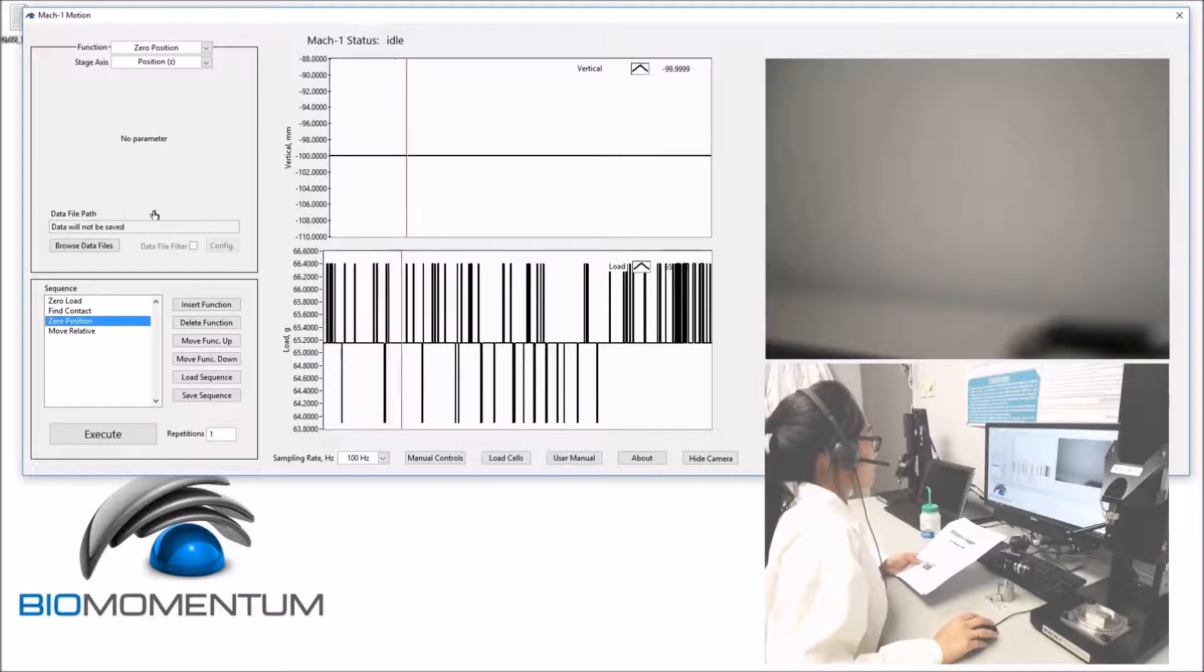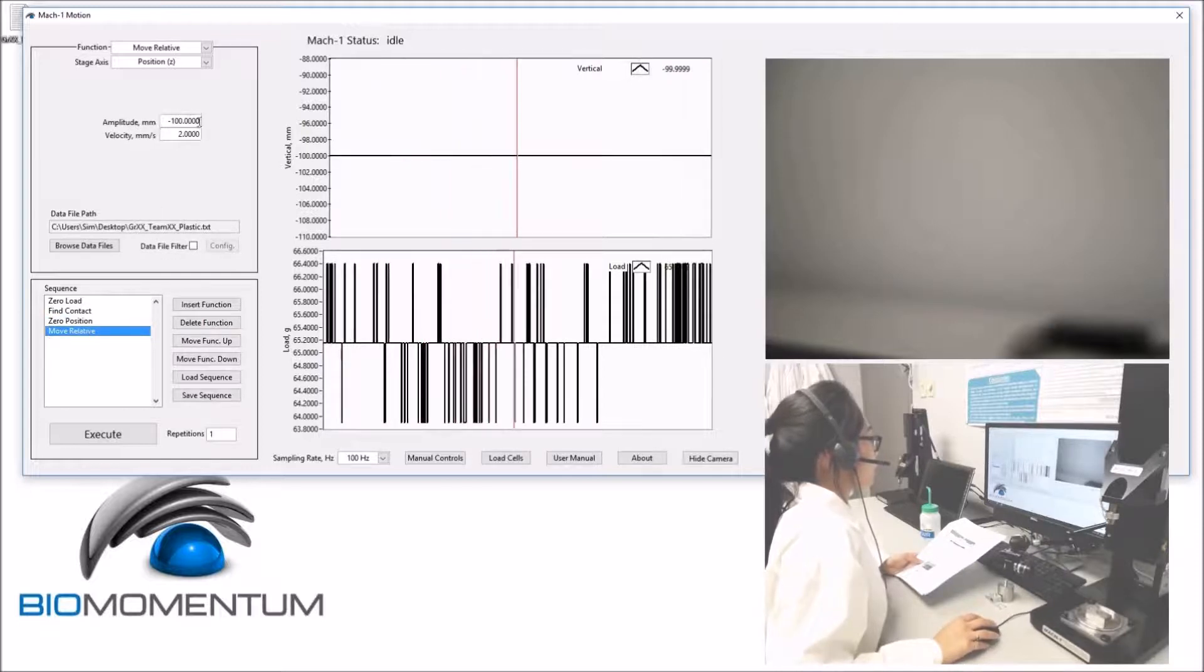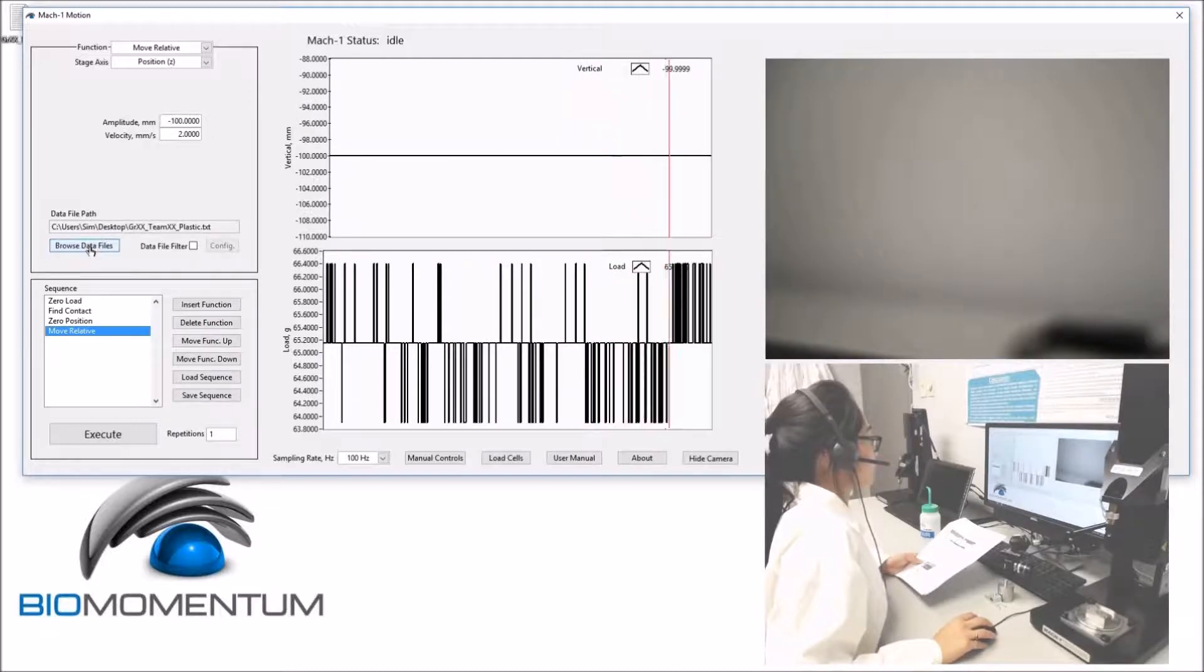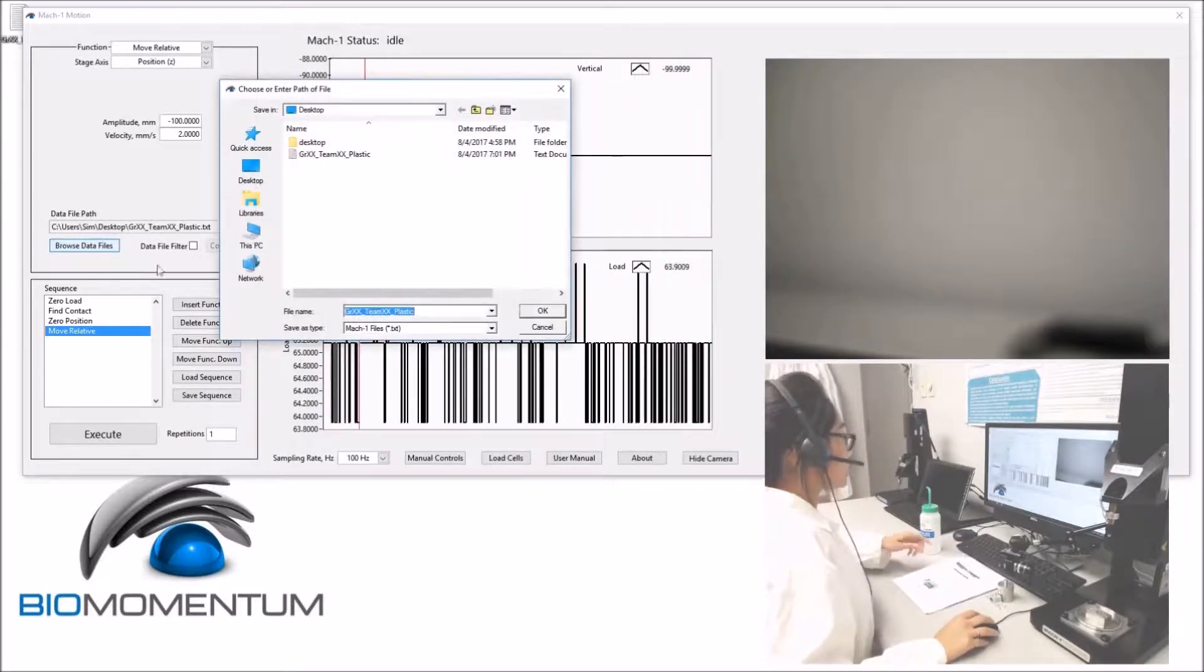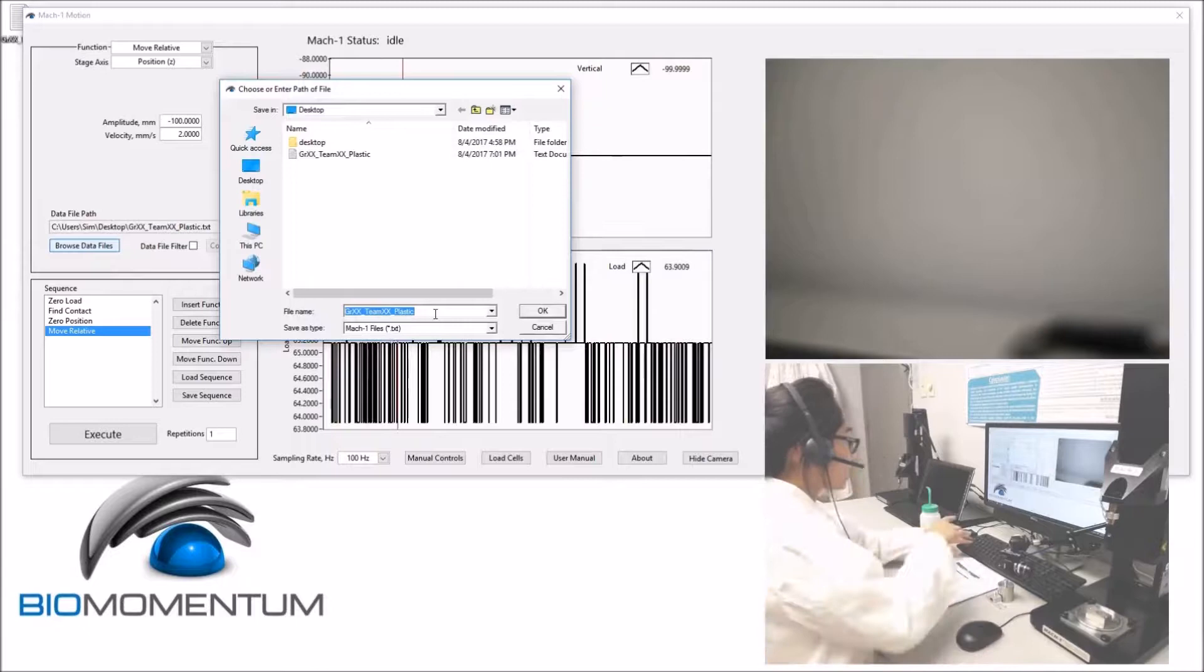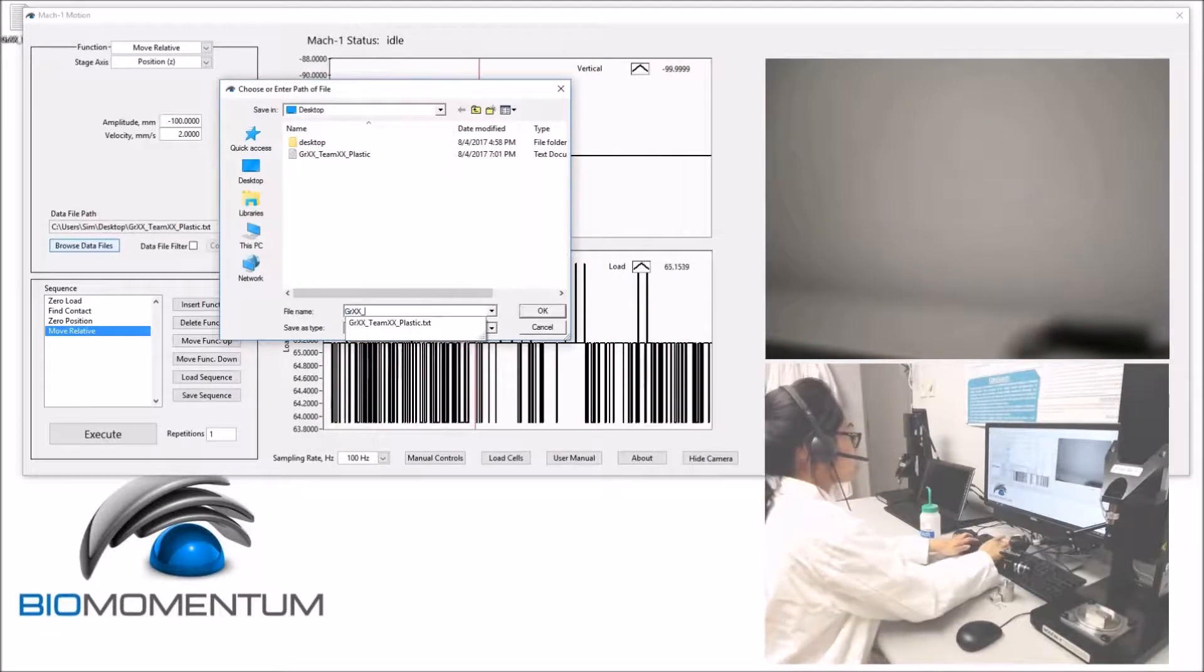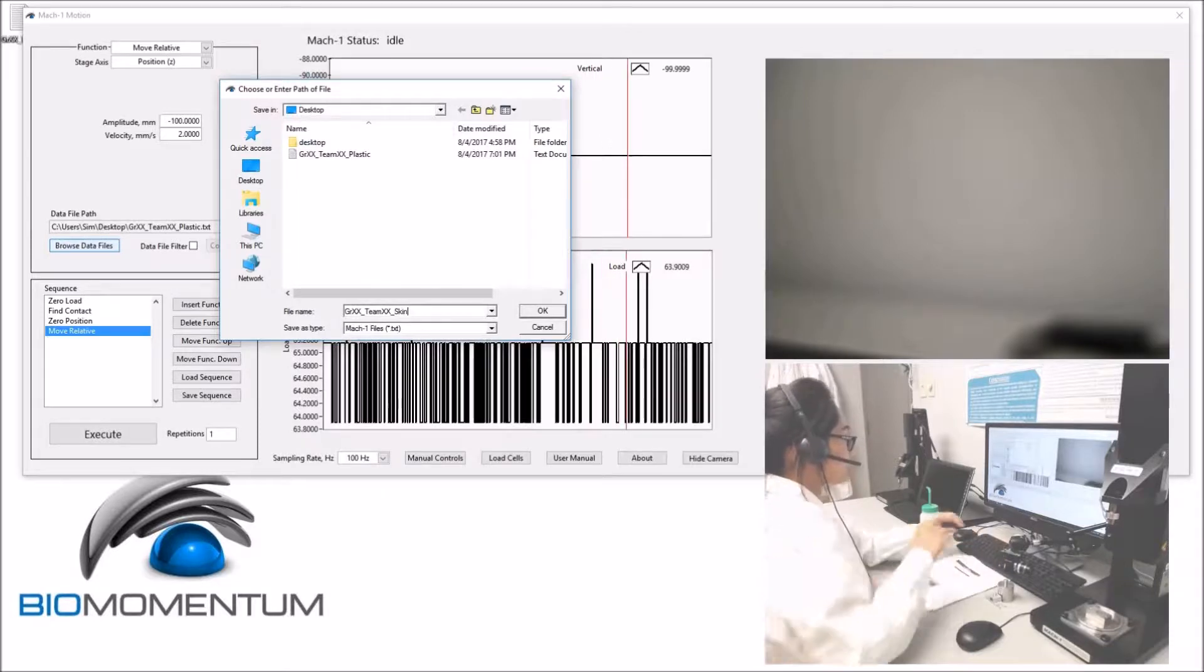Followed by a zero position and a move relative with a travel range of 100 mm at 2 mm per second. We will be saving the data as group number underscore team number underscore skin.